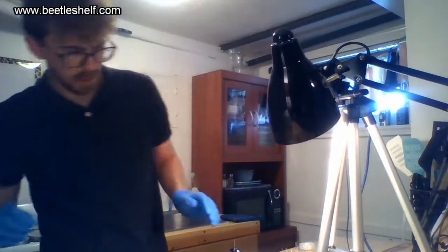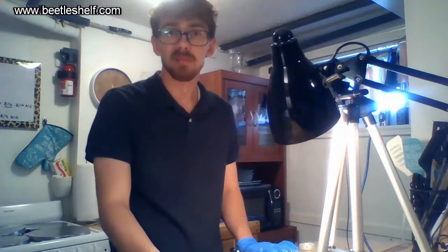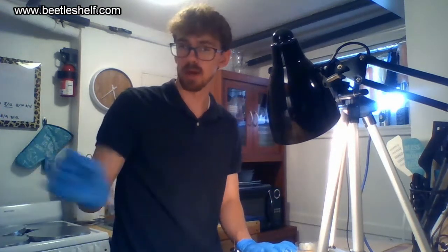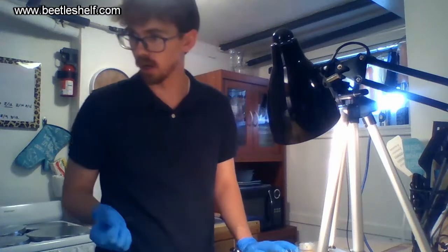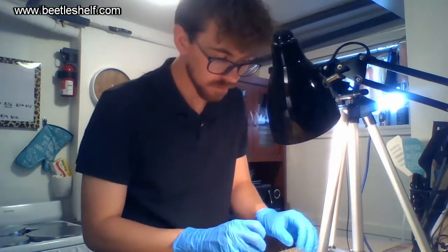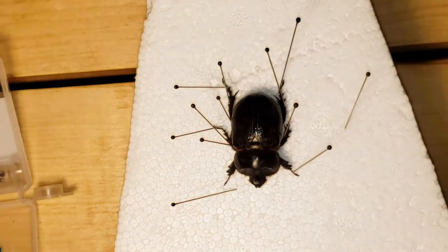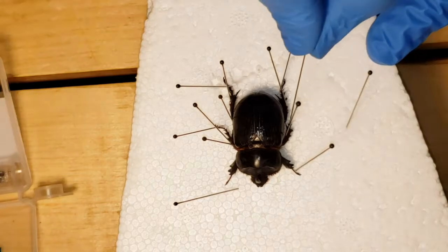After you pin it, you let it dry. Drying can just happen sitting out in your house for two weeks. These Lucanus mazama I have have probably been drying for two or more weeks. Sometimes it can take a while to dry, but that's okay.